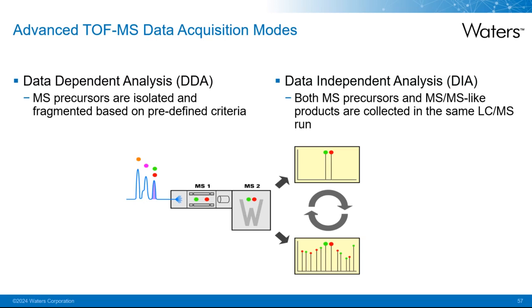In time of flight, the TOF system cannot physically filter the individual ions, so the TOF system records all the ions at the detector, so some of the experiments run on quad-based MS systems are not available on a TOF system, for example, neutral loss or MRM mode. But some modern TOF systems are capable of running an MRM-like experiment by only recording masses of interest and discarding the other masses, allowing both for high resolution and high mass accuracy data, and also quantitation to be run on the same system if necessary.